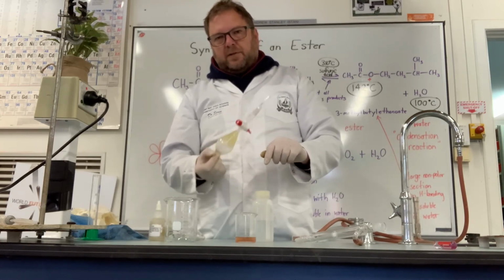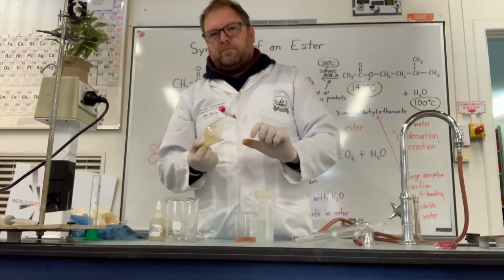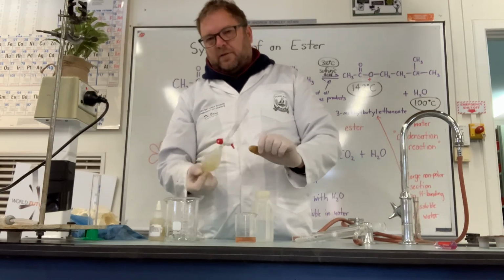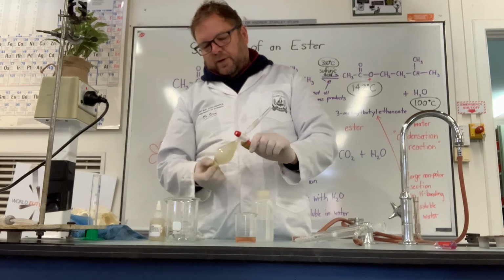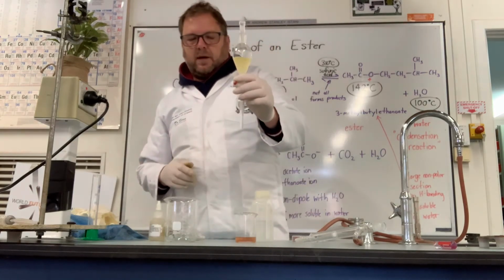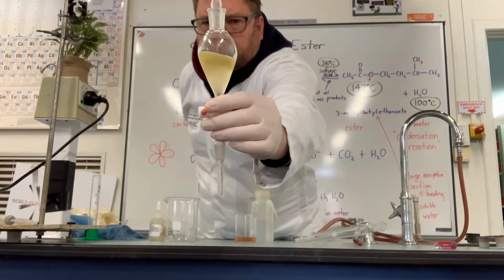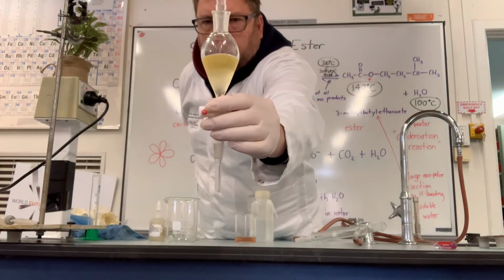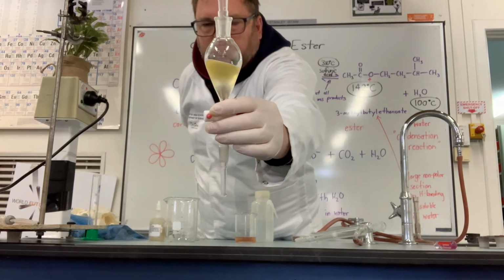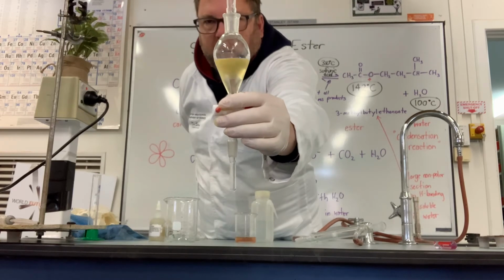And it doesn't matter if we don't get this perfect. It's really mostly about demonstrating the technique to you guys. And that's just about run out of fizz. Yep, it's just about run out of fizz. So again, just going to let those two layers settle back out. We've got the polar water-based aqueous layer at the bottom that had the carbonate, and hopefully it's got some more of the acetate ions in now, and it's taken them out of that top layer.